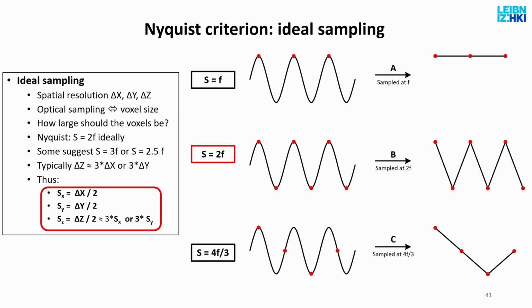I mentioned that it's not enough to set up the microscope to the maximum resolution. It's also important that our digital system records it. Because if I have a very low resolution camera, for example, and I try to resolve high resolution microscope images, it's not going to work.